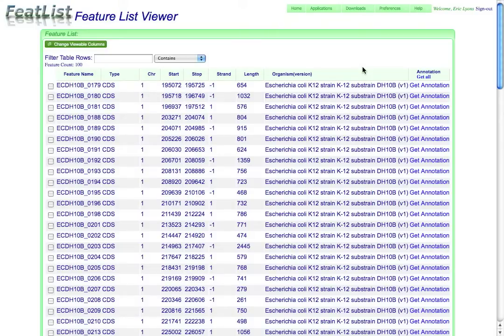Hi, this is Eric Lyons, and this is a tutorial on how to use FeatList, CoGe's application for managing lists of genomic features.